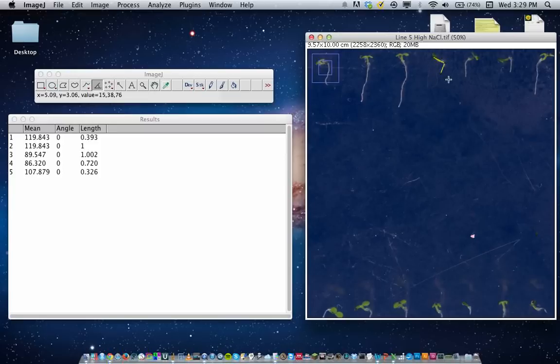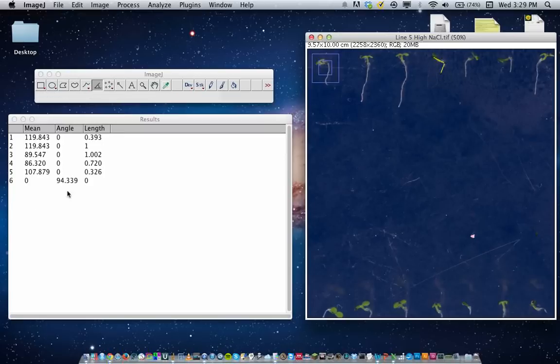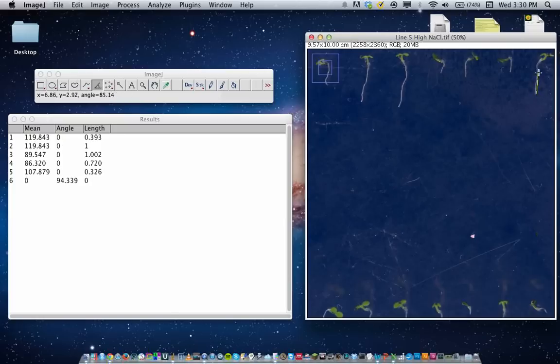And if you hit Command or Control M, it'll actually give you what the angle is. So another example, if I want to try here, Control Command M, and we're given the angles.